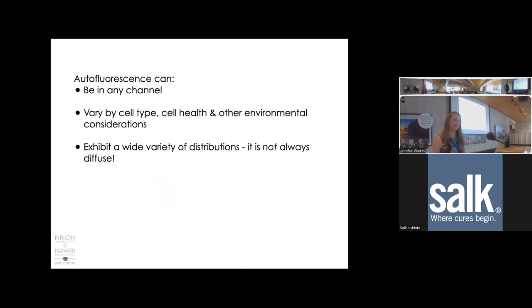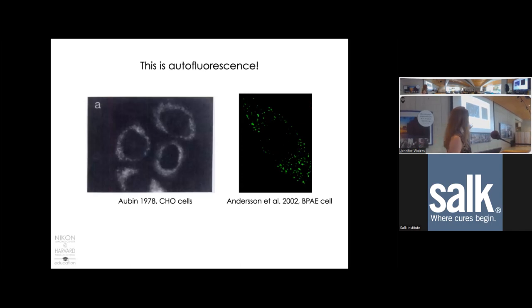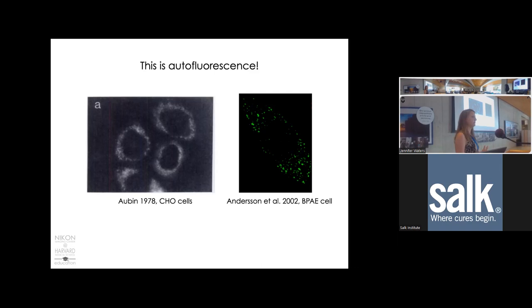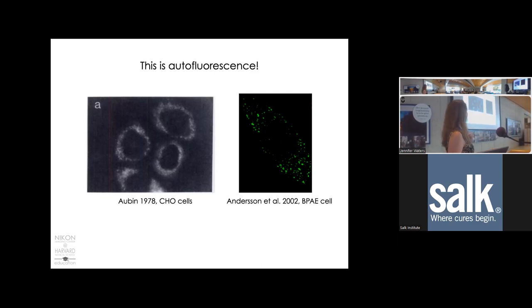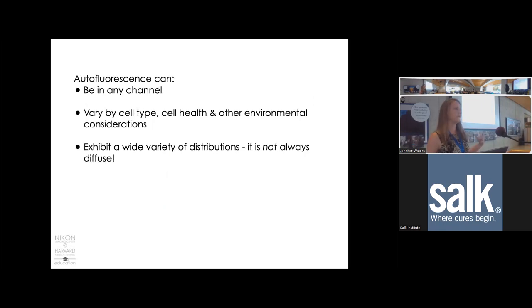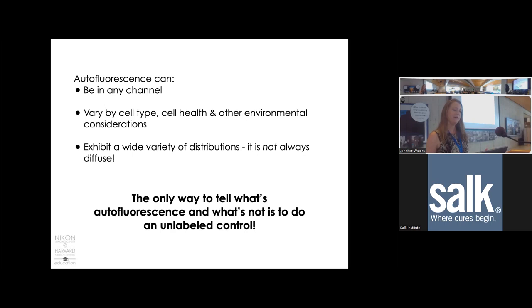Autofluorescence can occur in any channel, varies by cell health, cell type, and environment, and can exhibit a wide variety of distributions—sometimes looking like a specific, meaningful signal even though no fluorophore has been added. The only way to distinguish autofluorescence from real signal is to include an unlabeled control: a sample treated exactly the same as your experiment but without any added fluorophore.